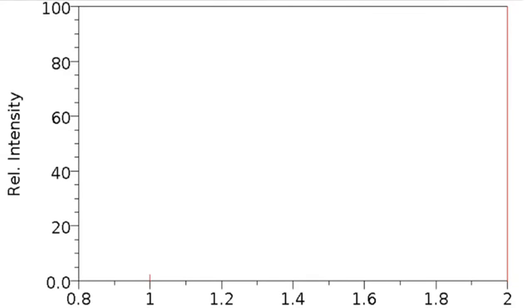The first spectrum on your handout is hydrogen. The red line, I know it's not red on your handout, is basically all the hydrogen. You can see that hydrogen comes as H2, so its mass is 2.